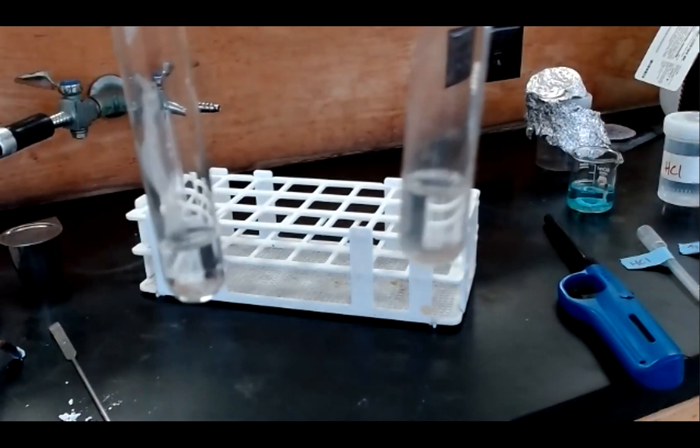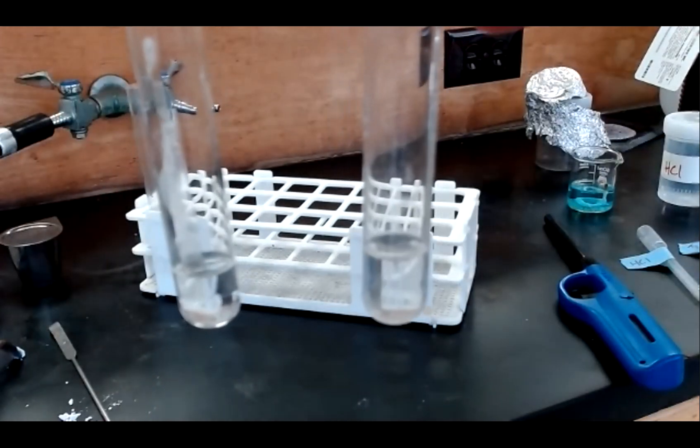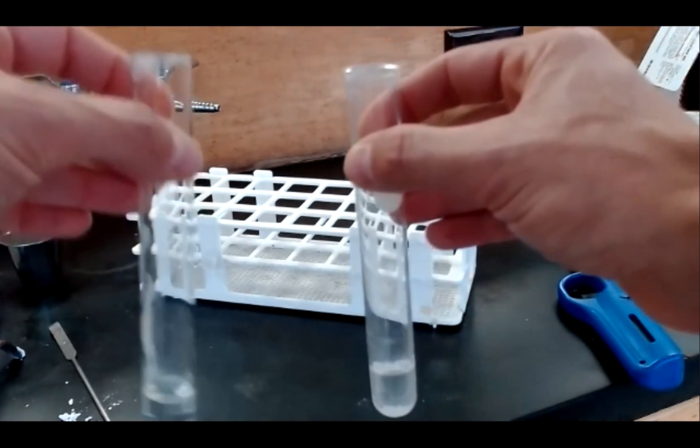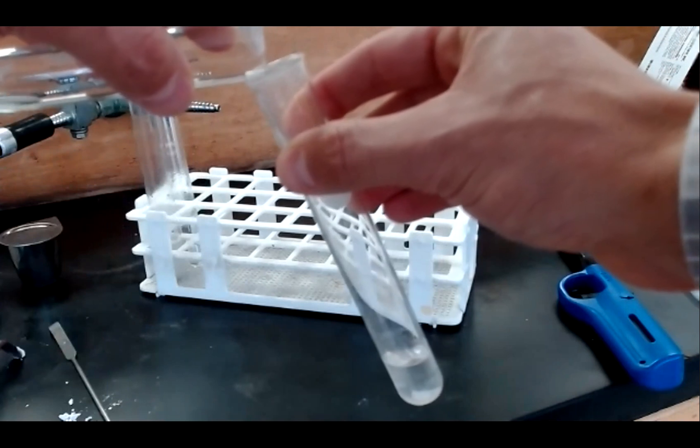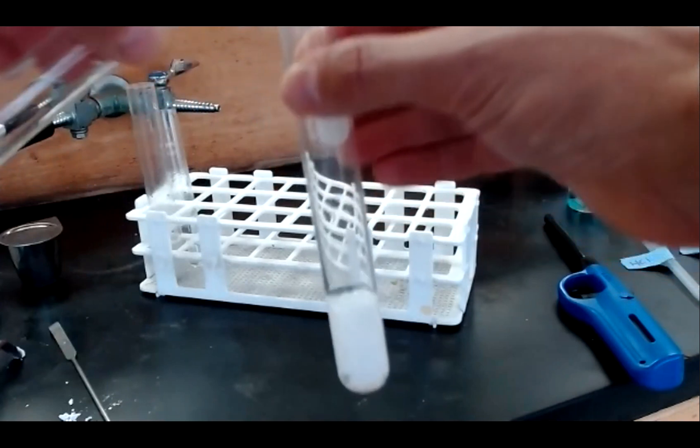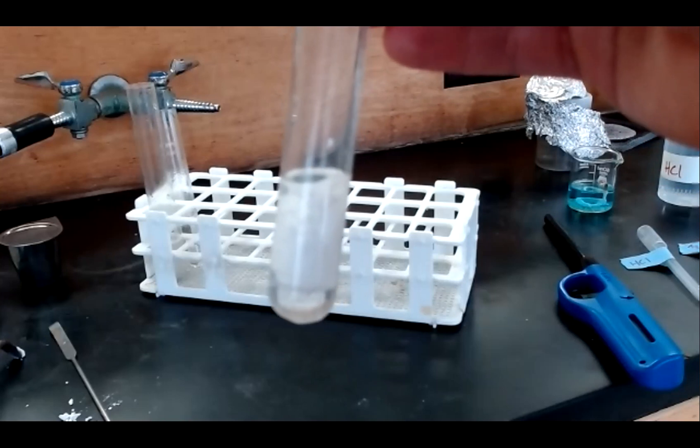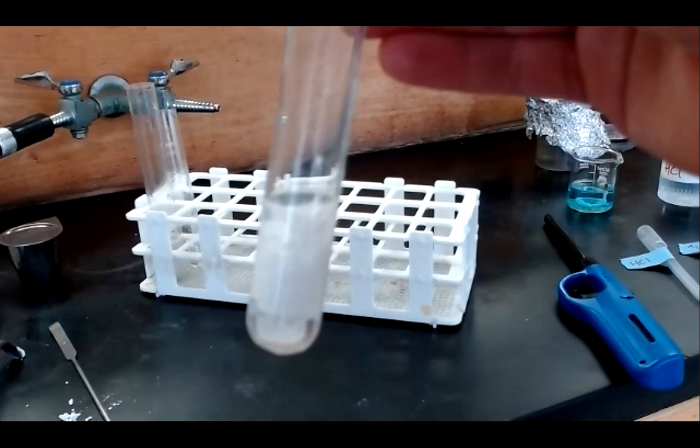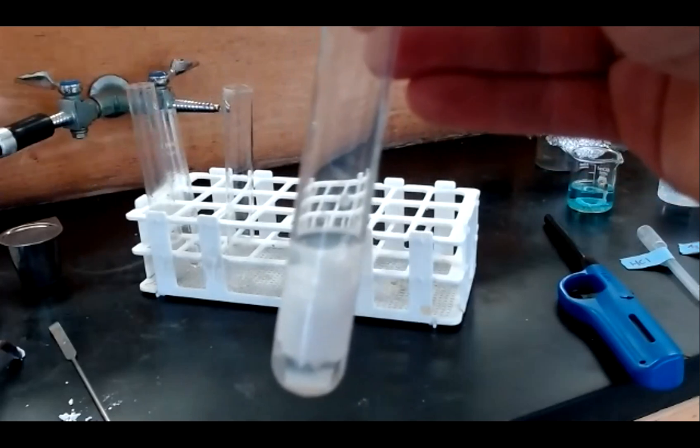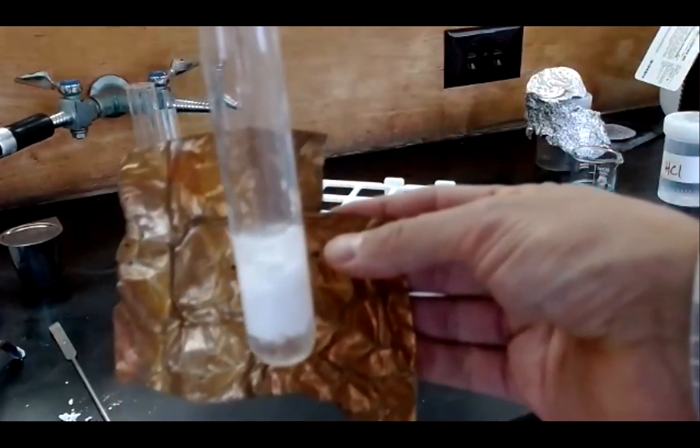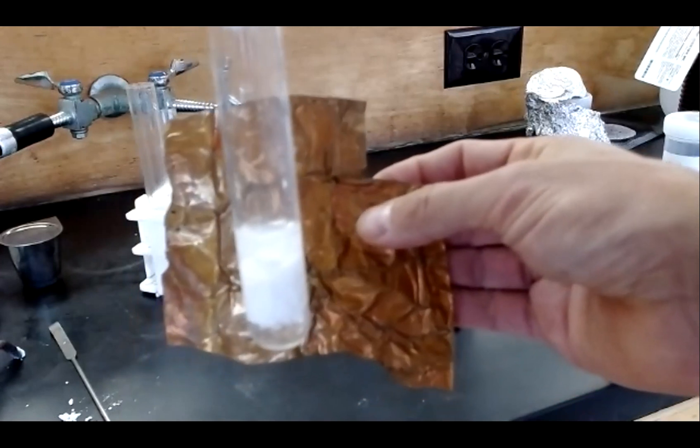There's the solution of hydrochloric acid, there's the solution of silver nitrate, no discernible differences between the two. Now what I'll do is mix the two solutions together. And right away you can see a solid white precipitate beginning to form. Get some contrast against that. There's our solid white precipitate.